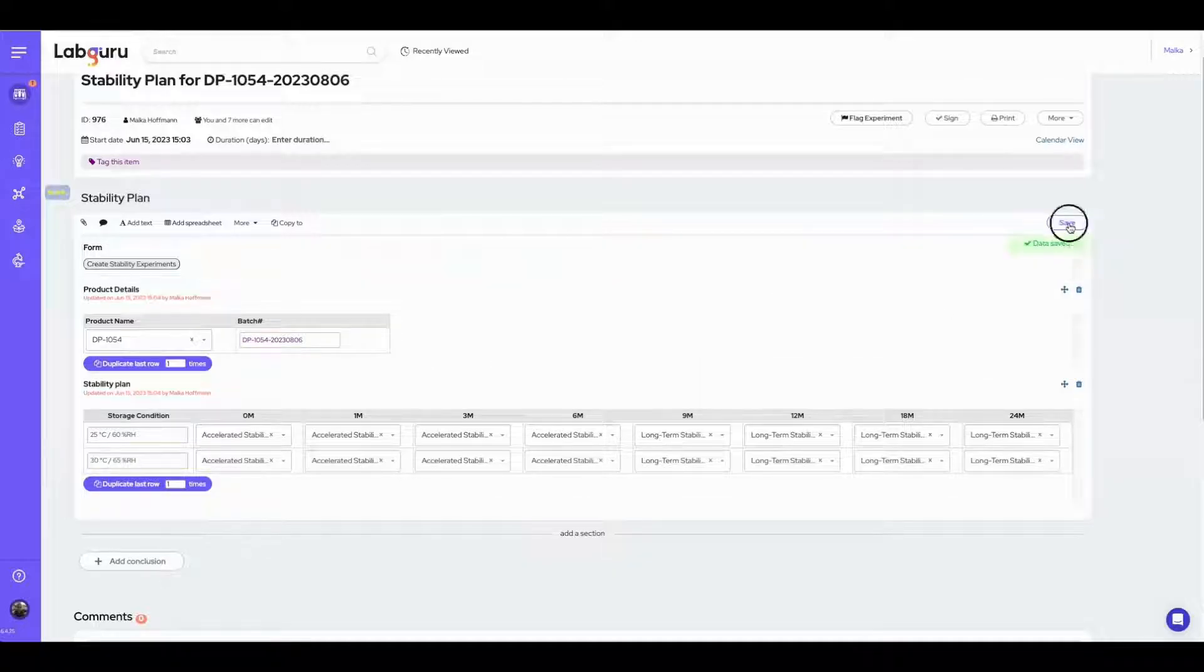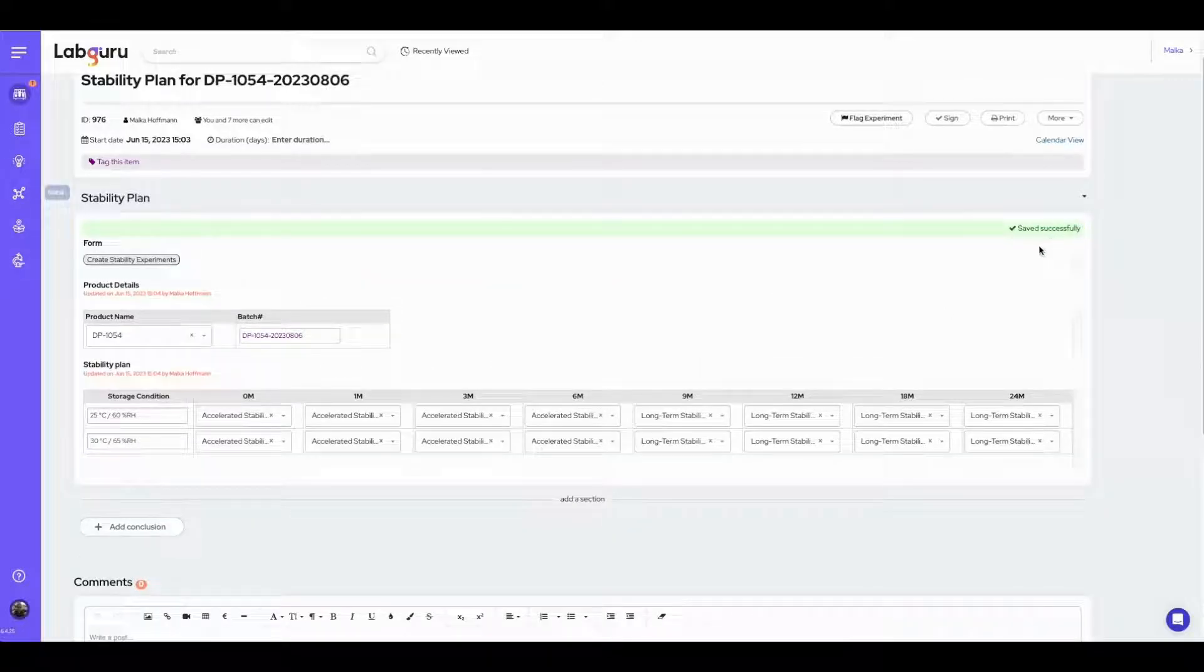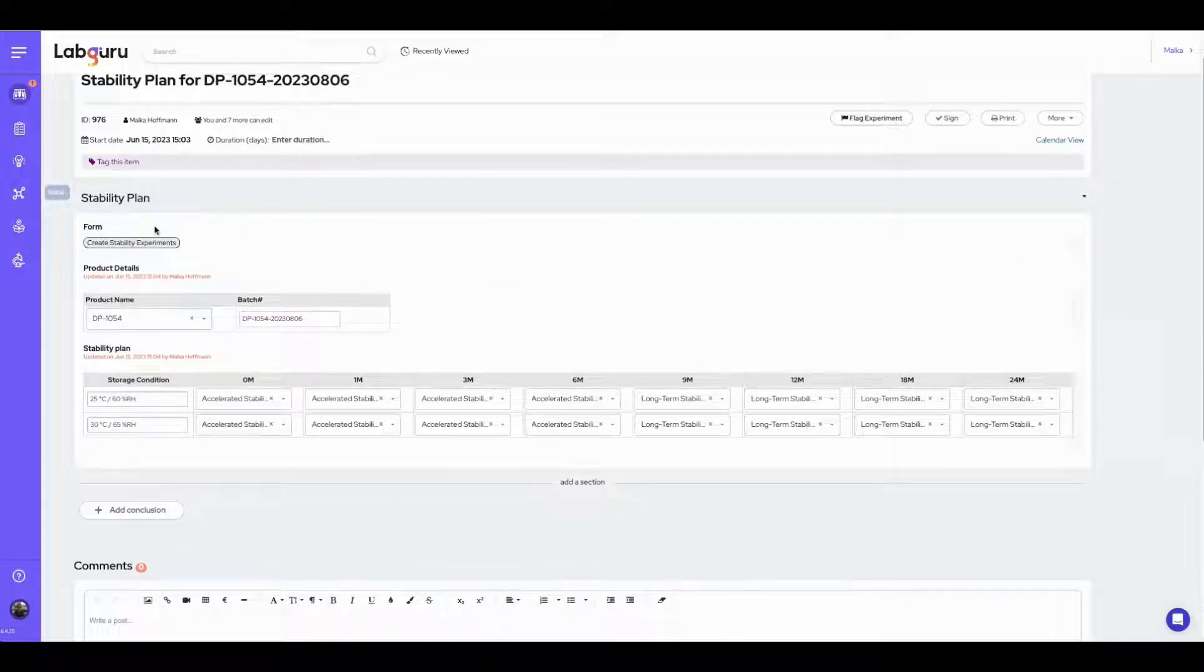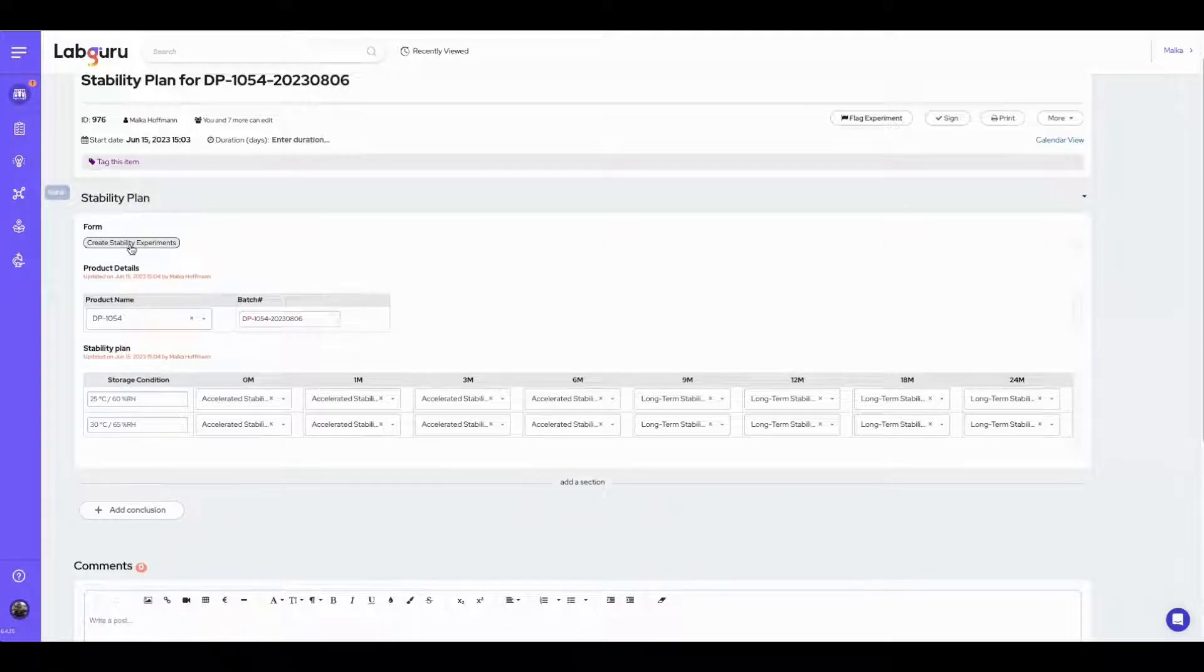Once planning is completed, I can click on the create stability experiments button, which will activate the automation.